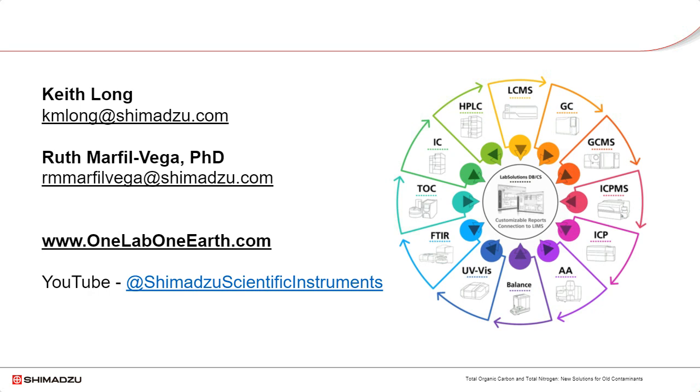That is a very good question. I'm not certain at exactly what level. It probably depends on your injection volume, but it's somewhere around a few thousand ppm. So somewhere around a few thousand ppm of salts or halogens in your samples are going to start having detrimental effects to the analyzer, where you would want to add these scrubbers to start scrubbing some of that stuff out.